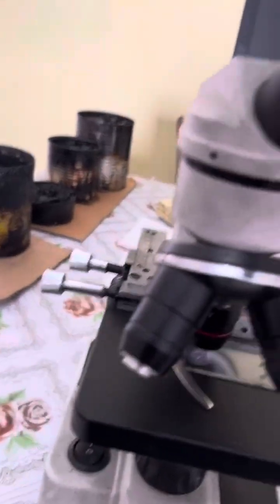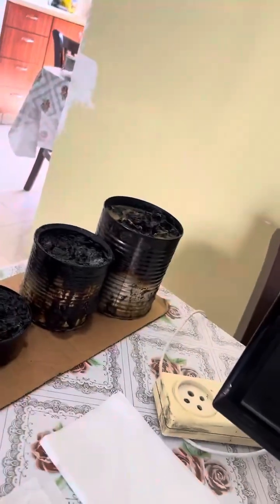Okay, so while we continue, we upload the first part of the examination. Let's take a look at the other four slides. The microscope, as I said, is in a very bad condition. Maybe it's fixable, I don't know, but it's mostly the mechanical stuff. But the rest of the subsystems are also kind of like they should be replaced. Hopefully we can continue.